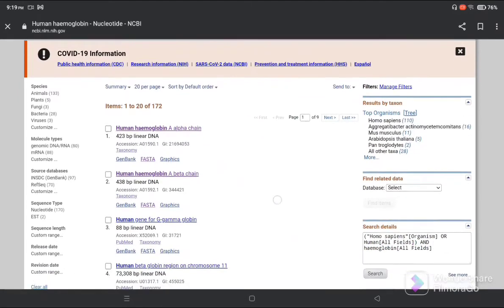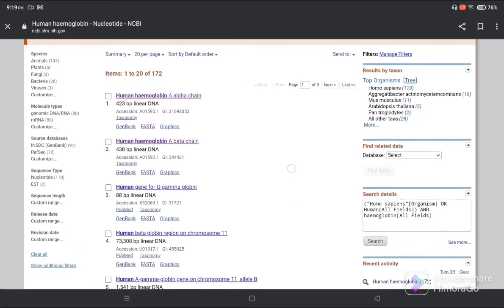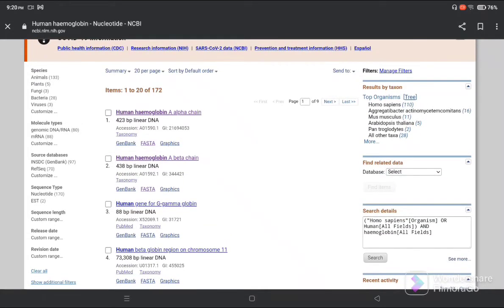In my previous video, I used human hemoglobin A alpha chain for X-BARC. Today I will use the human hemoglobin A beta chain. Click on hemoglobin A beta chain.